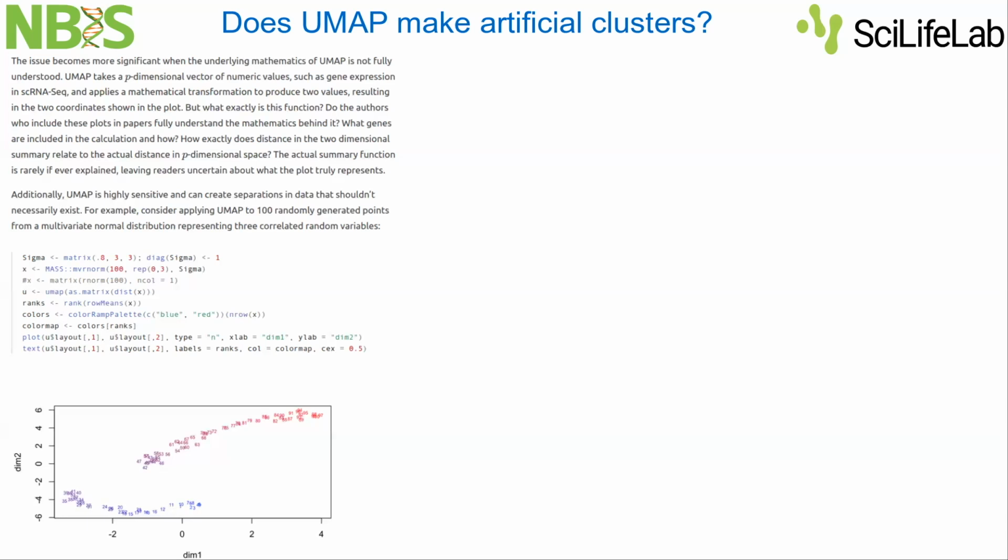Yeah, UMAP can be tuned in many ways. Maybe you did not explore the whole range of hyperparameters, because these clustering and dimensionality reduction algorithms are just zoom in, zoom out tools, and it depends on you where to stop. You can say all my cells are separate clusters, or all of them together are a single cluster. Those are two extreme cases, and it's up to your question where to stop.